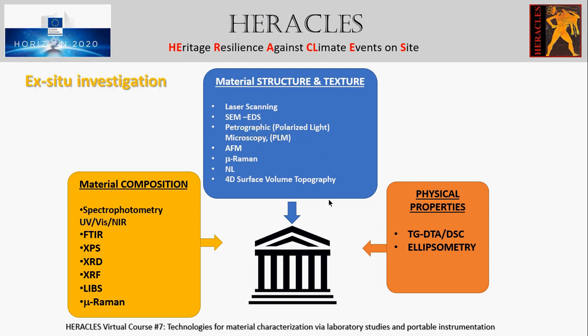Micro-Raman microscopy allows to obtain information about inert inclusions, neoformed crystals and aggregates, microcrystalline structures, being useful for the non-destructive characterization of inorganic materials such as mortars, binders, and stones. It might be useful to supplement or confirm results obtained with other methods. This technique is considered non-destructive, and the sample recuperation is full.